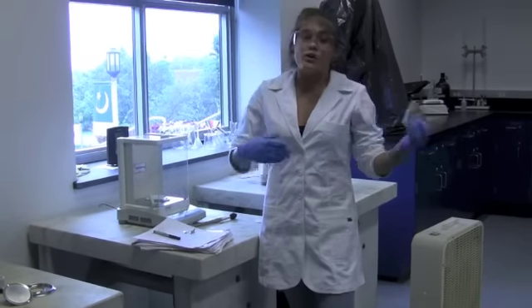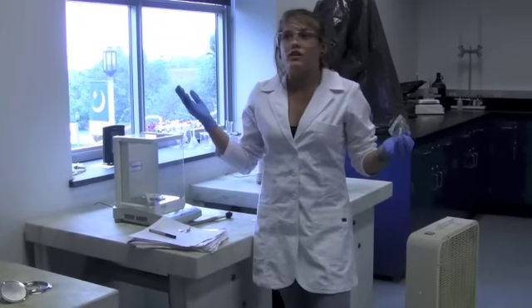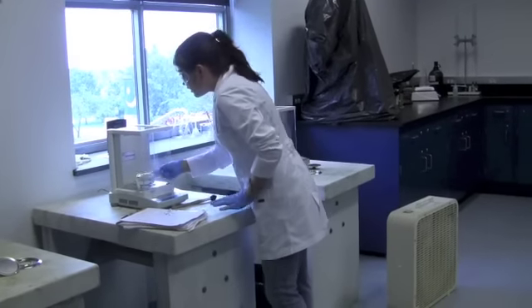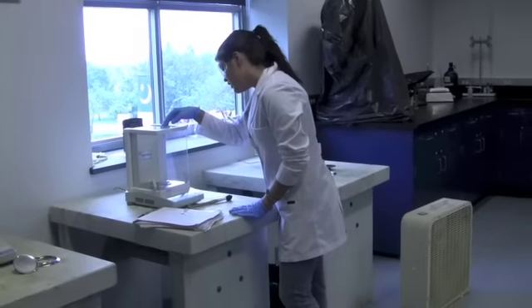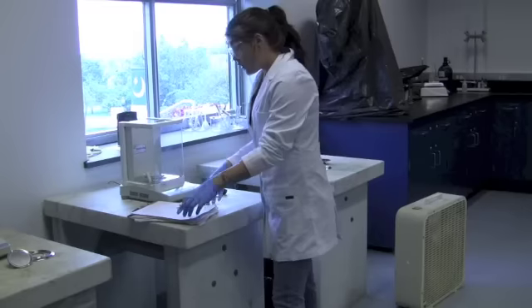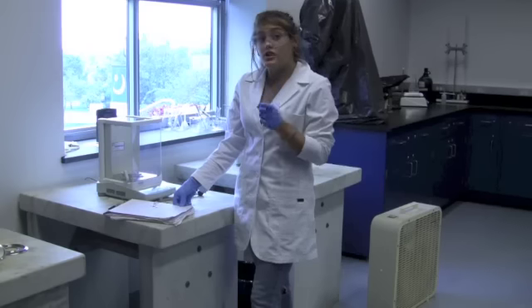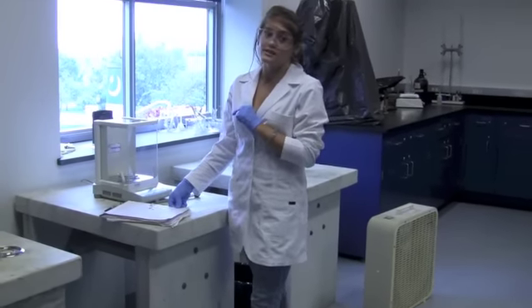So say you have 0.4932, that's acceptable, or 0.5127. They're all within an acceptable range. Just make sure not to be too far off. My reading is 0.5186. So I brought my lab book back with me so that I didn't have to try and remember the number on my way back to my station. Always remember to bring your lab notebook back, and always remember to record to 4 decimal places.